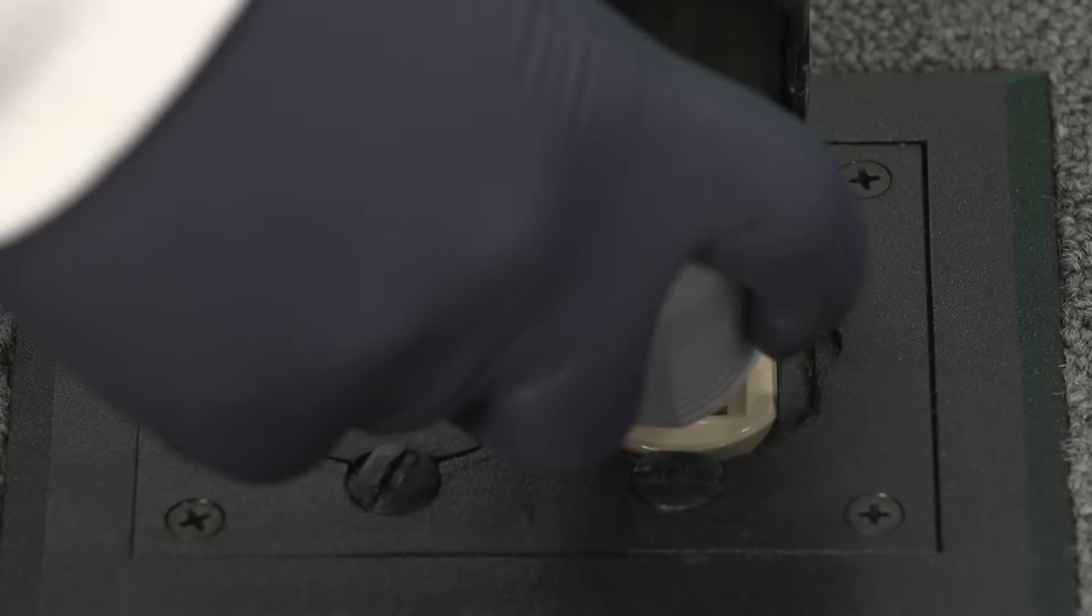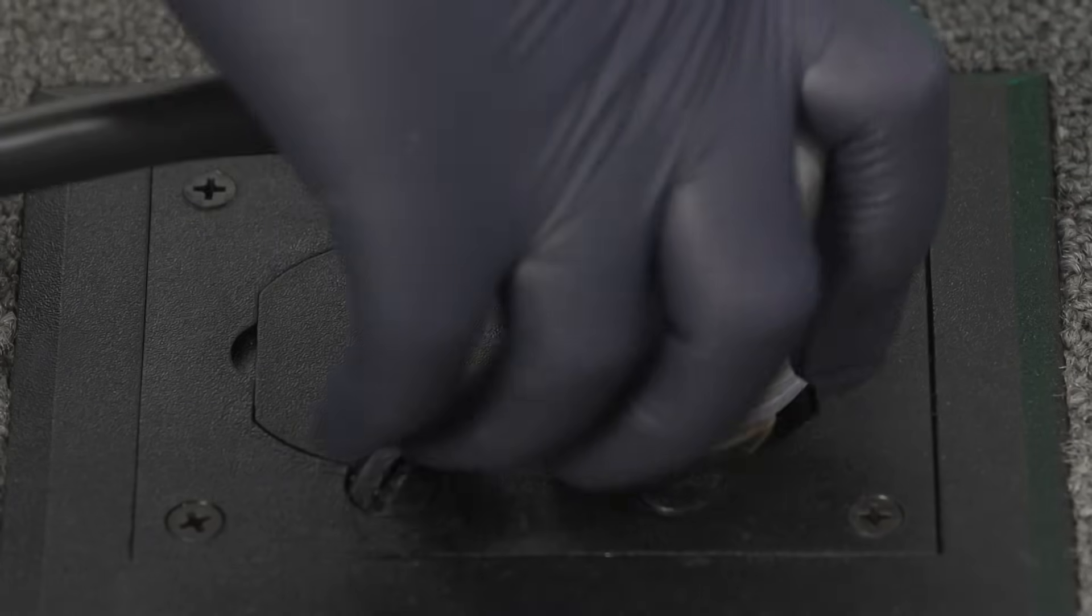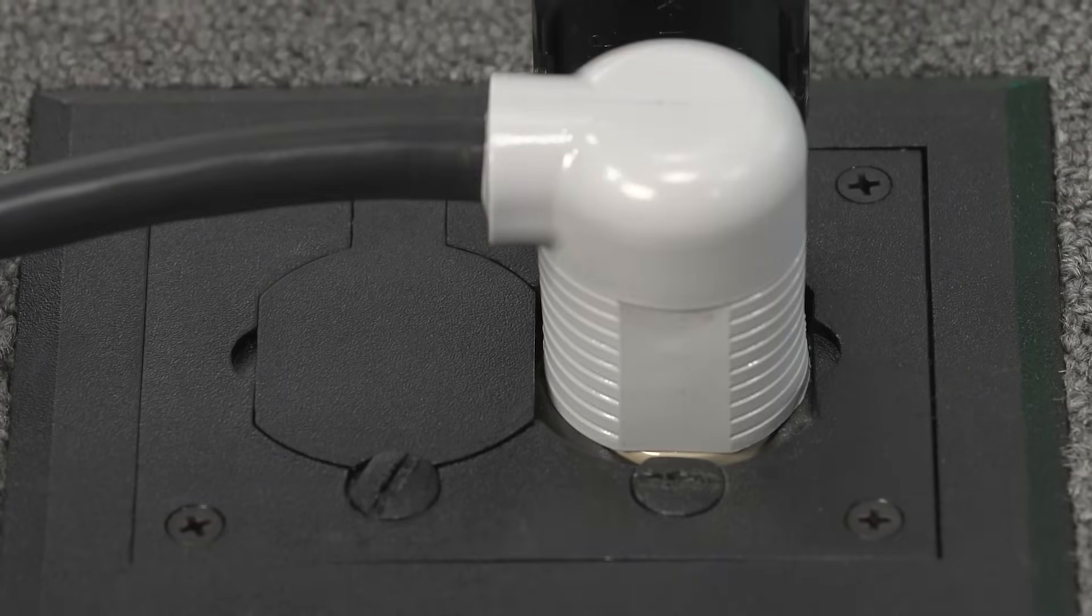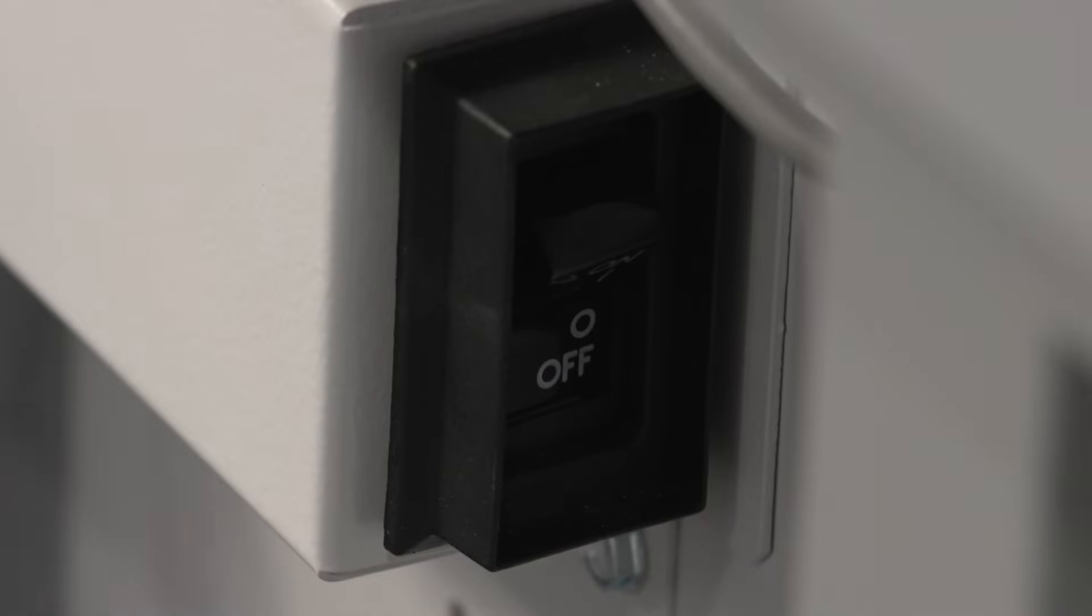Then plug the cord into your wall outlet. Once you've plugged in the power cord, you can power up the freezer itself.